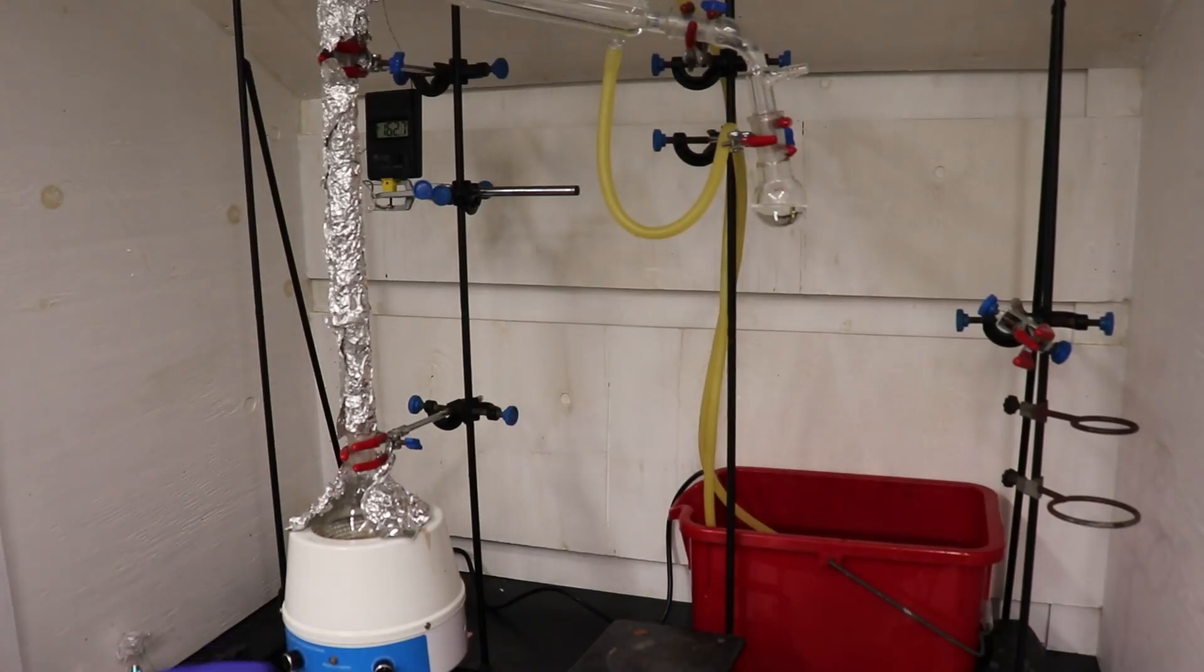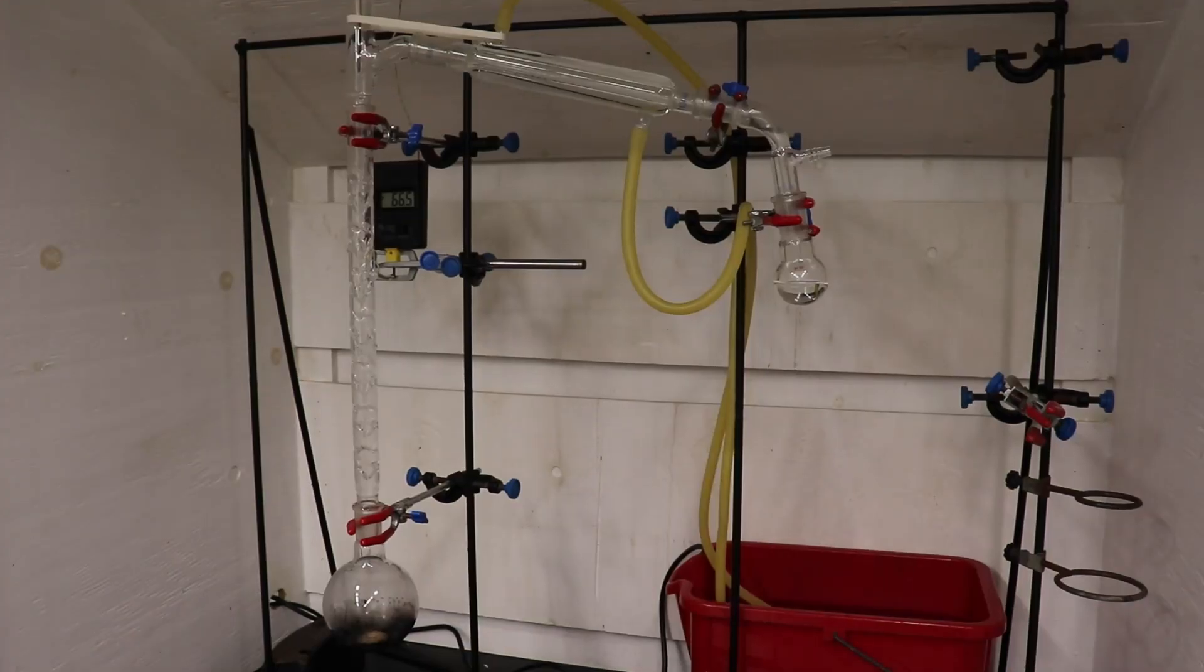Eventually the rate of distillation slowed, and the stillhead temperature began dropping. This observation shows that I've collected as much ethyl-2-bromopropionate as I could, so I turn off the heat and stop the distillation.